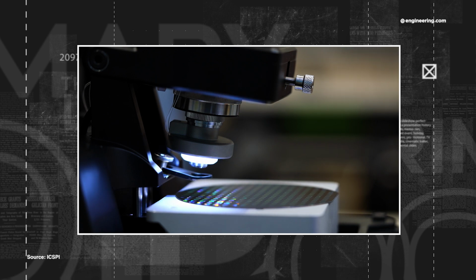In the future, can you see a role for automated AFM? Definitely. So, when it comes to industrial applications and industrial use of AFM, the big industry that uses it is the semiconductor industry, and it still really isn't used in line as a technique because it's still a bit too slow. You're scanning a really small area. I mean, typically up to about 100 by 100 microns, and the breadth of a human hair is 100 microns.